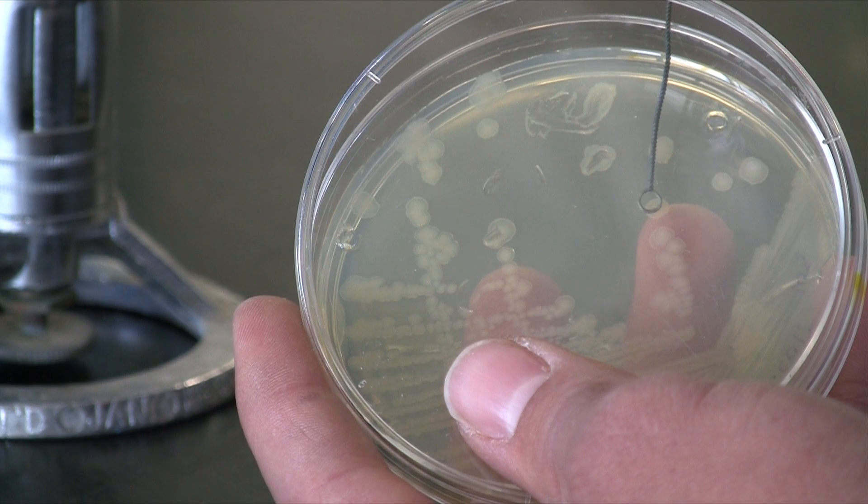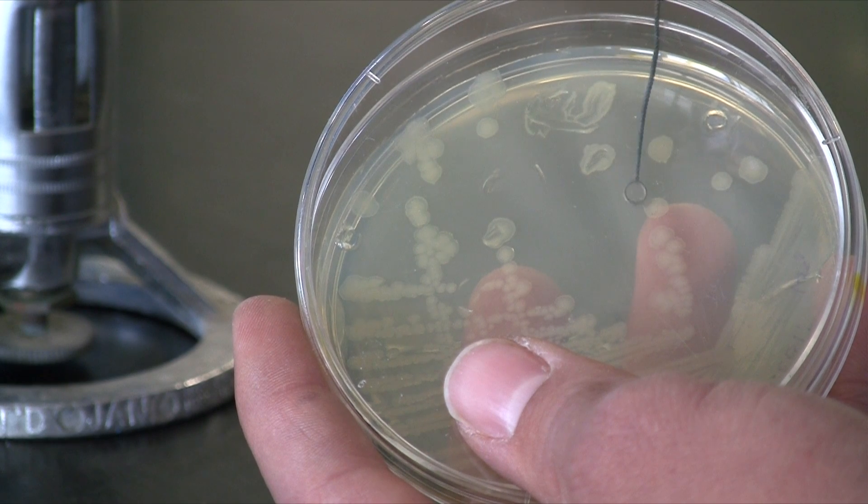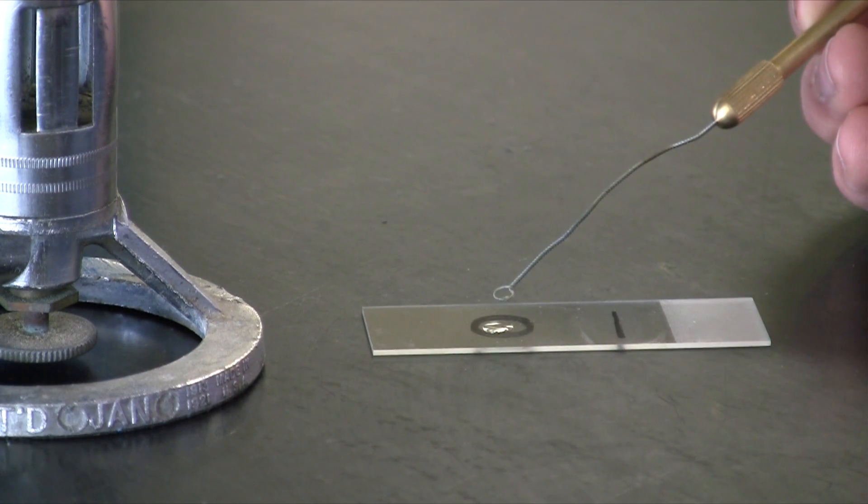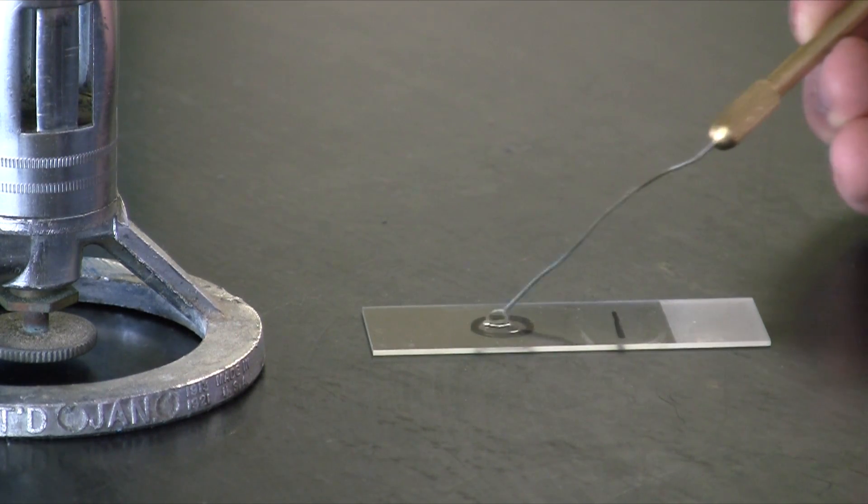Now you're ready to add your bacteria. Make sure to grab just a piece of a single isolated colony. That will be plenty of cells — in fact millions to billions of them.